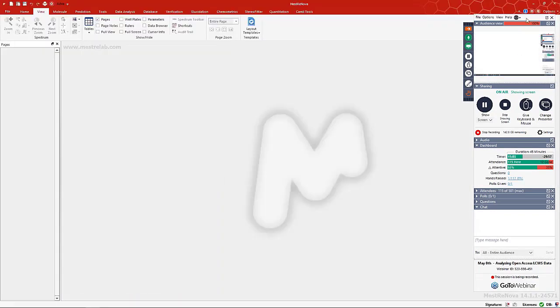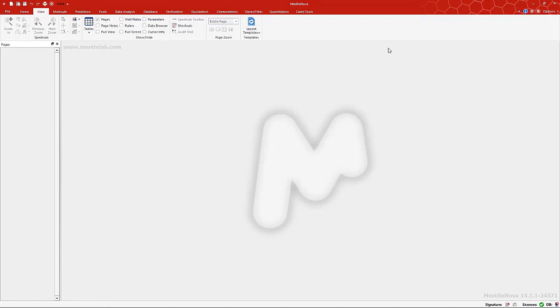Okay. So what I'm going to do here is, so this is Mnova. I've opened it up. It's blank. There's nothing there. All you see is a column that says pages, and that'll have a list of all the pages you're currently working on.